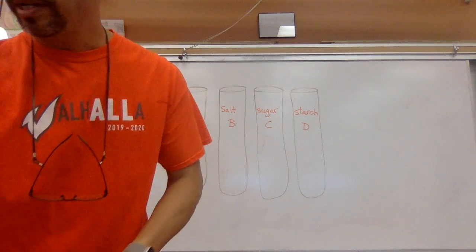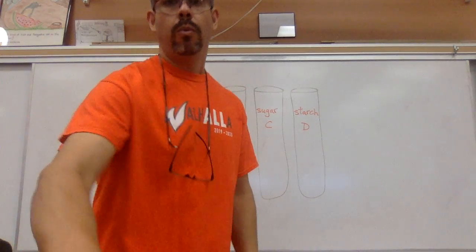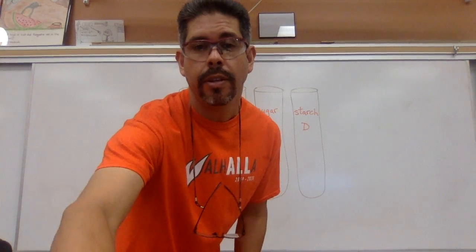This is just one little quick demonstration. I just wanted to show you how we can use little lab experiments to determine the content of food items.